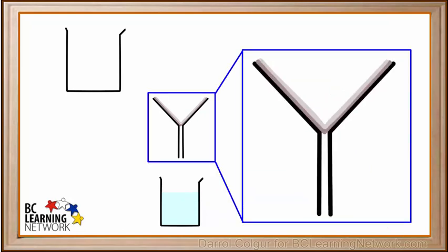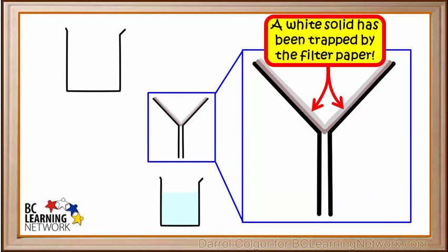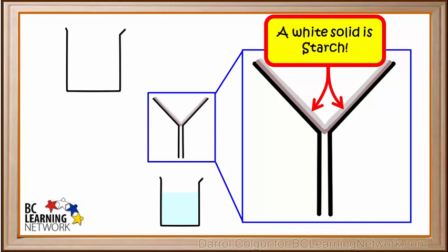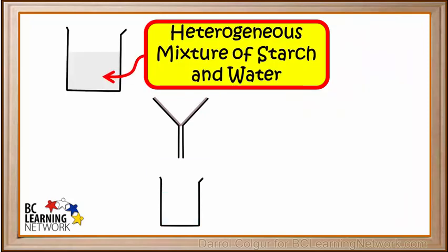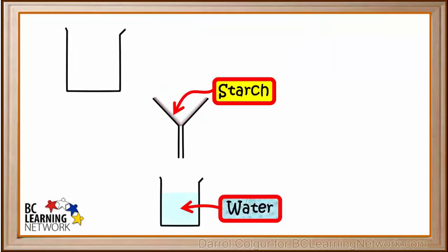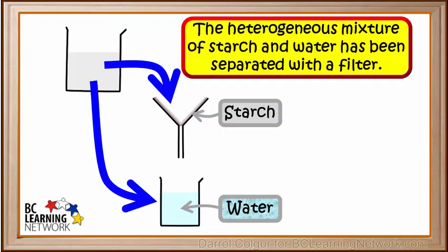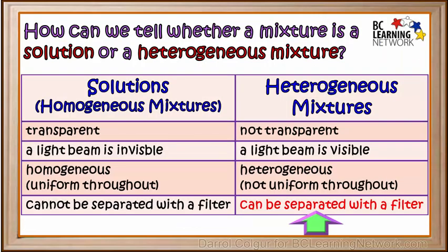Now we'll take a closer look at the filter paper in the funnel. We see that a white solid material has been trapped by the filter paper. It turns out that this white solid is starch. So we started out with a heterogeneous mixture of starch in water, and we ended up with starch in the filter paper and water in the bottom beaker. So we see that the heterogeneous mixture of starch and water has been separated into starch and water with a filter. We'll note in our table that a heterogeneous mixture can be separated with a filter.